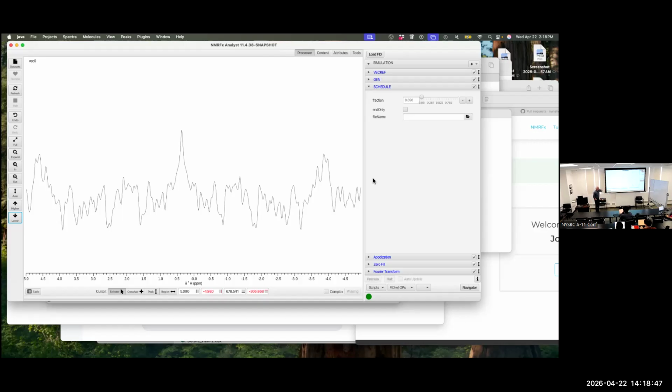Which is why when people talk about noise, they often talk about what's called the point spread function. That actually comes from optics, about how light going through an orifice spreads out. Effectively, there is this point spread function, which is based on the sampling schedule, or actually the Fourier transform of the sampling schedule, and it basically spreads our signal out. So this stuff that looks like noise is effectively stuff that should be where the signal is.